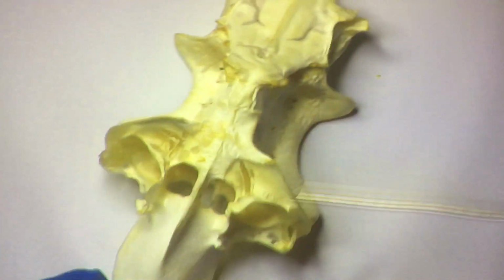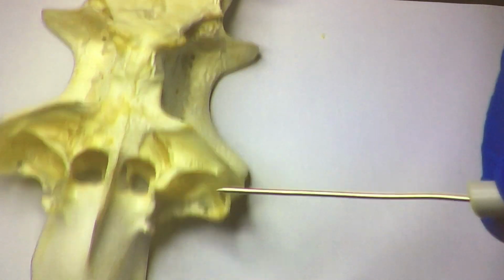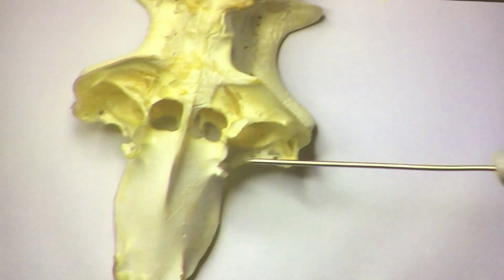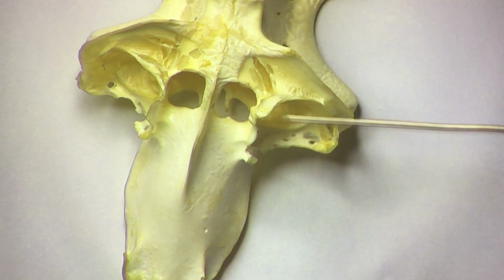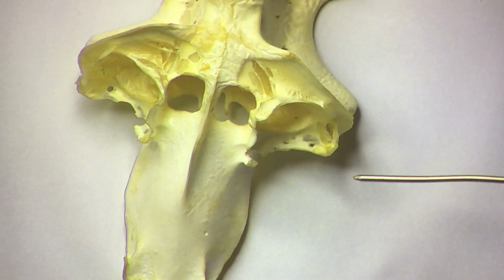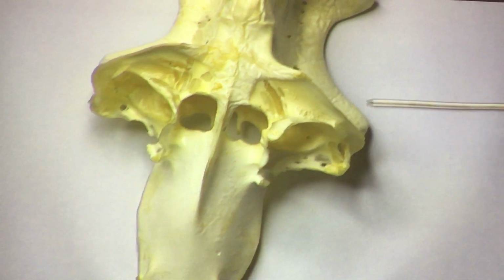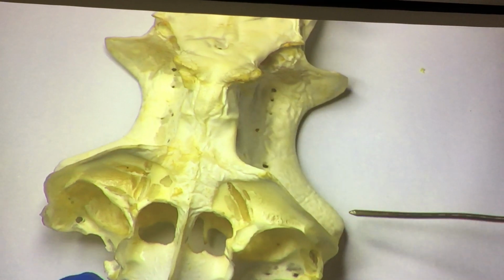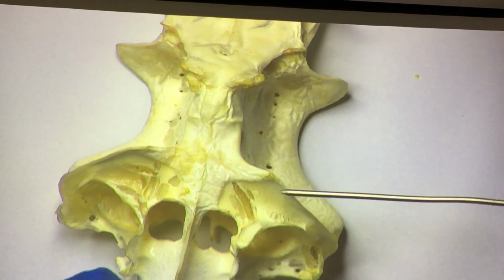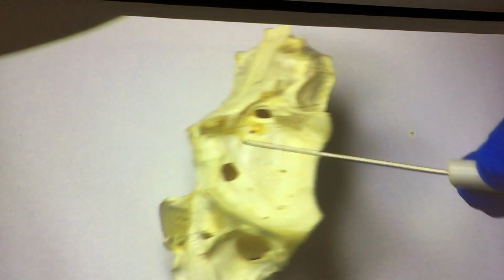All right, so here, this thing that's all broken up should look like a sphere, like that big golf ball of the Epcot Center. And that's the olfactory capsule where the olfactory nerves are. And Ryan got to see that really well because the shark he was looking at, they left the olfactory nerves in place. And it misleads you, makes you think it's the eyes, but no. Okay, here we see our antorbital process, the process in front of the orbit. Our postorbital process here, also called the orbital shelf.